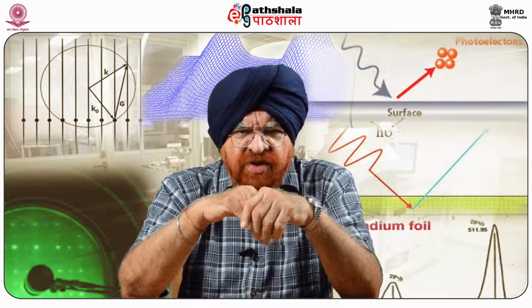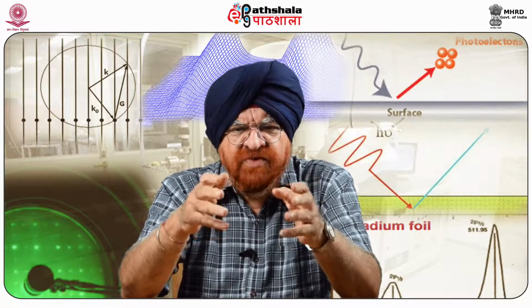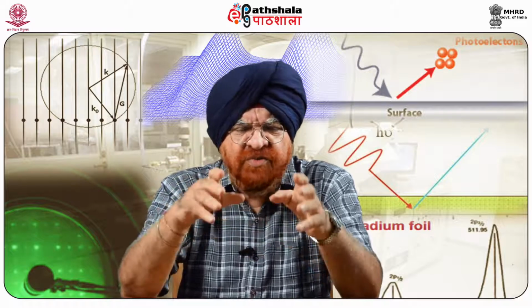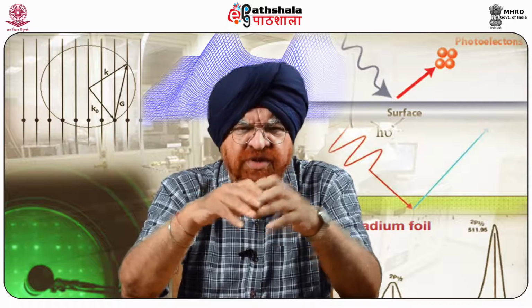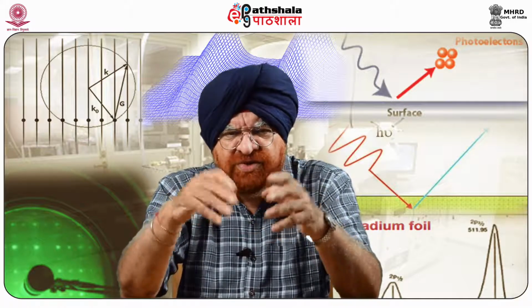The spatial resolution of STM is fantastic. It is excellent. But the temporal resolution is typically on the order of seconds, which prevents STM from imaging fast kinetics of electrochemical processes, and this is one of the very big limitations when we talk about the mechanisms of various reactions, particularly biological ones.